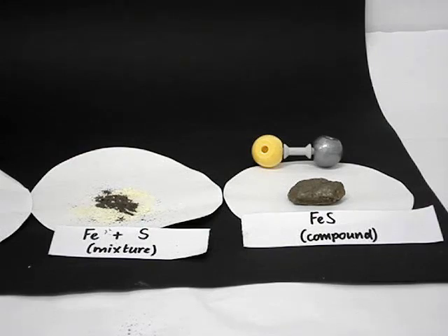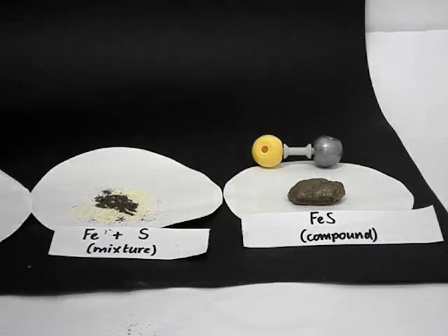Now, how does the iron sulfide compound compare with the iron and sulfur mixture? Let's check if we can now separate the iron in there from the sulfur. We take a magnet and see if we can do what we did before.